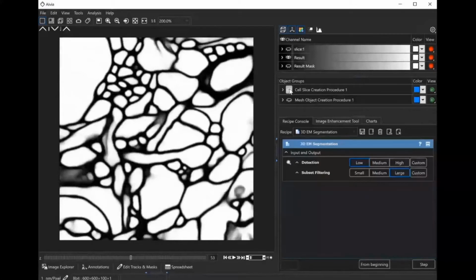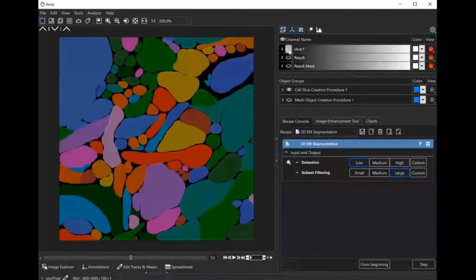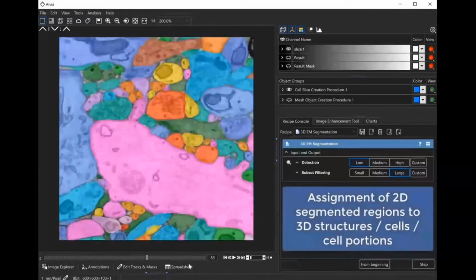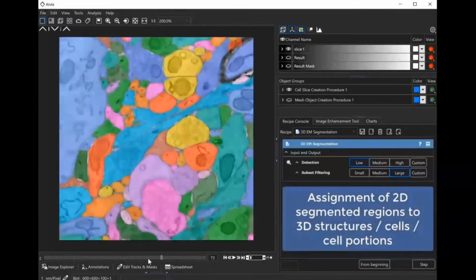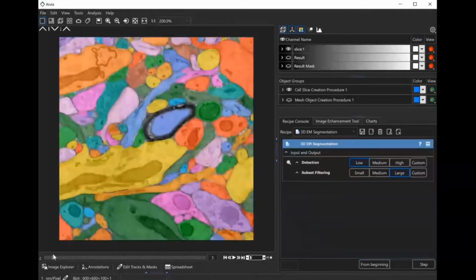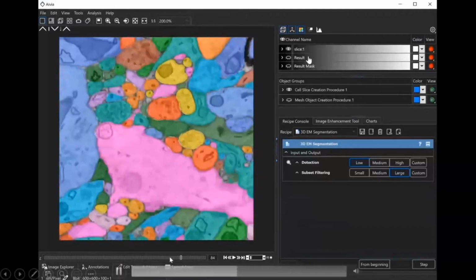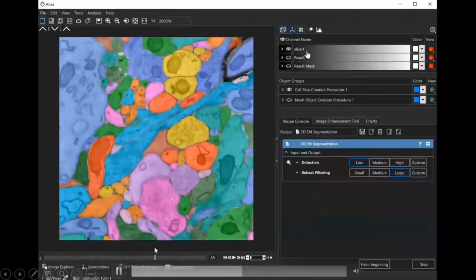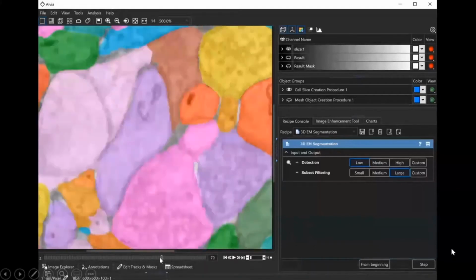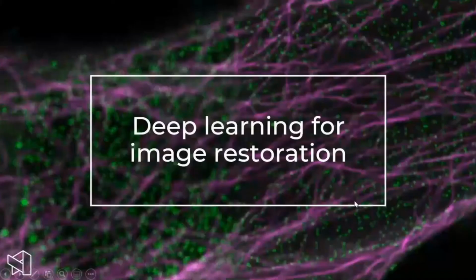And the first step is, of course, do the segmentation. And in this NIH project, we're doing the segmentation, the tracing, and then the circuit tracing as well. All of this powered by Aivia and Aivia Web. So this is the sequence of events that need to happen. We'll look at this data set together in the live demo in a moment.